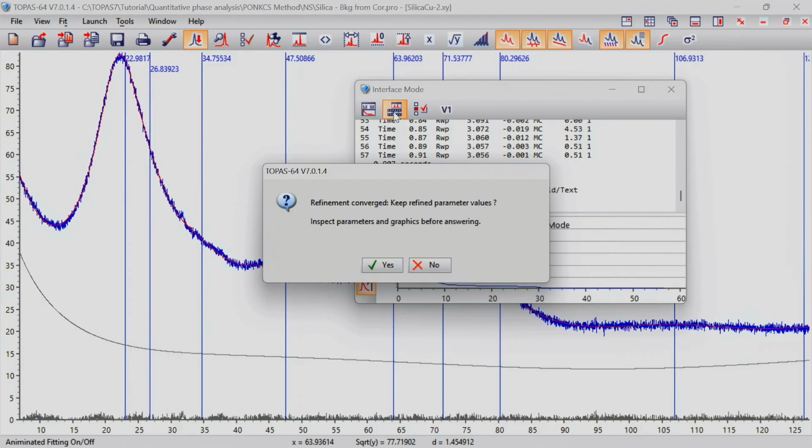I could, in this particular case, also use even the crystal structure of cristobalite to come to pretty much the same result. These are all alternative methods. I believe it is important to be aware that such methods exist, because there's not just one single method which will always give you the best result, particularly if you're dealing with more difficult cases. So yeah, that is all possible.